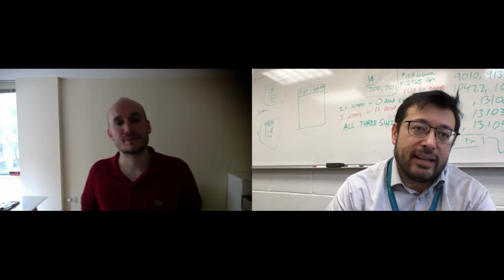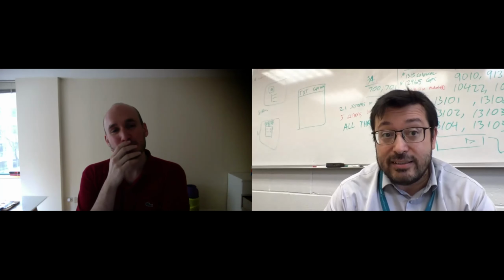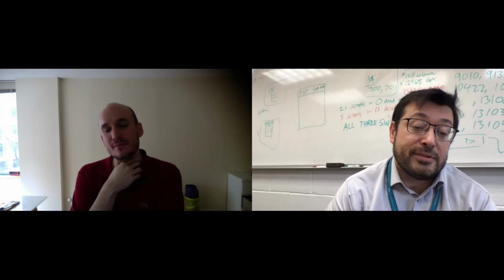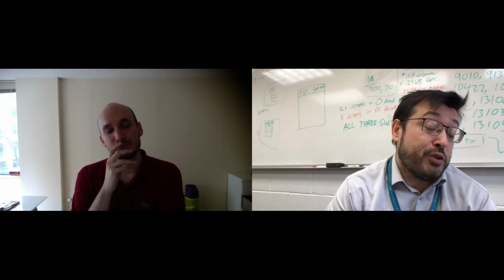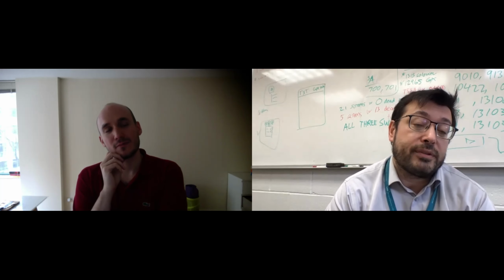Yeah, and most of the genomes now are pretty close to complete, like they're very high in completeness. So I don't see a big use of NG50, but that's my bias. I mean, I would not use any of these. Or when you try to compare two different species that have different numbers of chromosomes and different genome sizes, that's complicated, right? And NG50 will not address the distribution of your chromosomes. Right? If one species has a few large chromosomes, you get a different N50 than a species with a large genome and a lot of chromosomes.